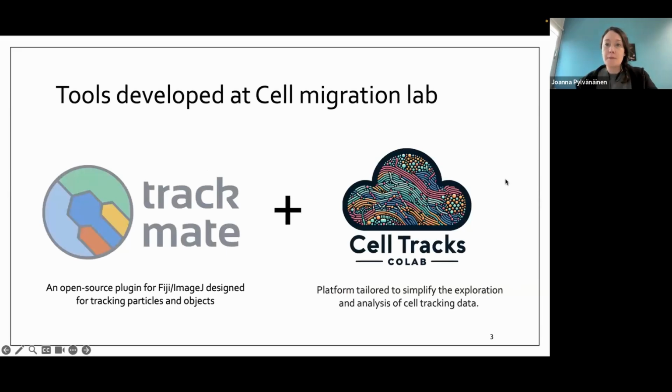Here we go. So I will introduce two tools that we have developed in our lab. The first one would be TrackMate. This was developed in collaboration with Jean-Yves Tinevez's group in Institut Pasteur in Paris. And this is a specialized software for tracking of microscopy videos. Then in our lab, we have developed CellTracksColab, which is a platform which can be used for further analyzing the tracking results and for plotting the data.